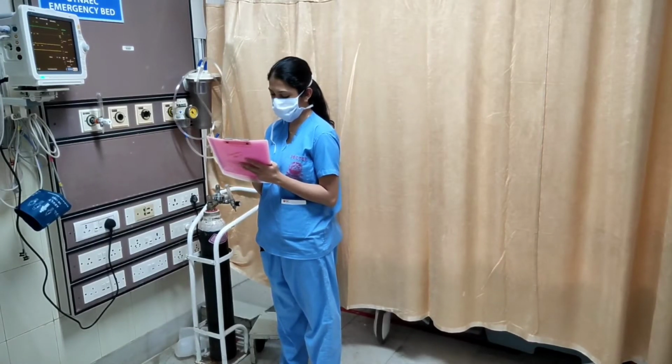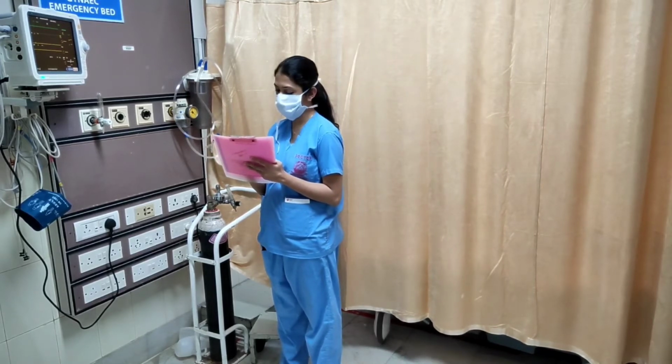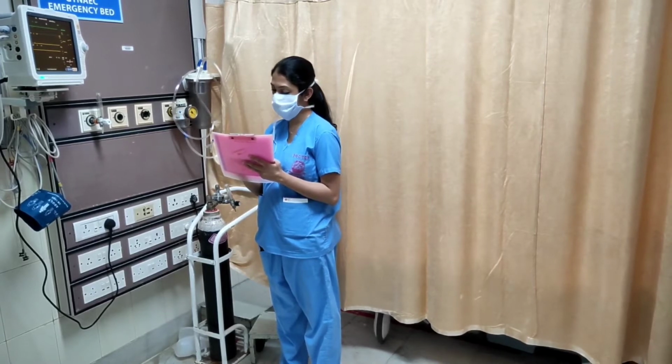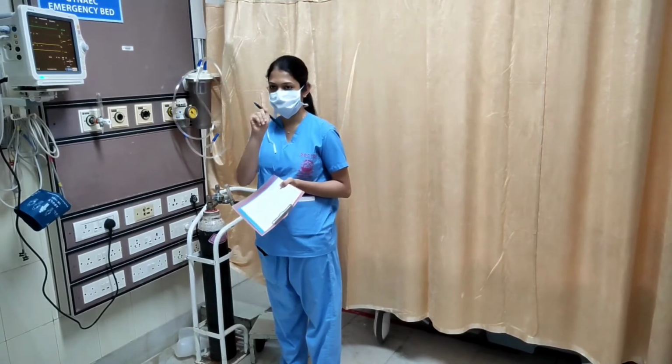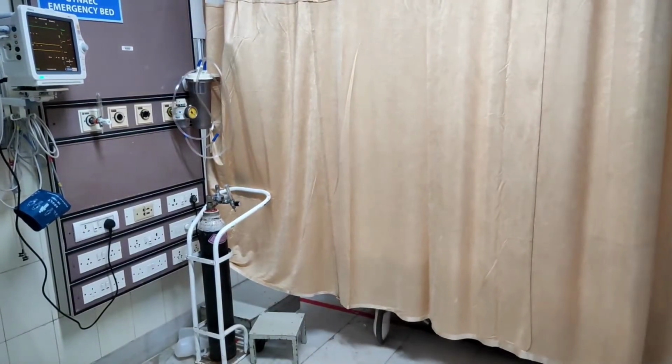Once you have got the adequate attention of your spotter, give them adequate time for putting on their personal protective equipment before coming and helping you doff your PPE. Do not enter into the outside area without their permission.